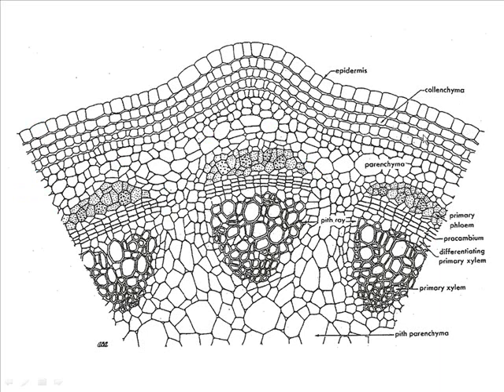Collenchyma. What does collenchyma provide for the stem? Flexible support, yeah. And then we have parenchyma in here, and this parenchyma down here would be called what? It says pith parenchyma. Ooh, they should have put something up here. What kind of parenchyma positionally would this be? Cortex. Where's the cortex end and the pith begin?